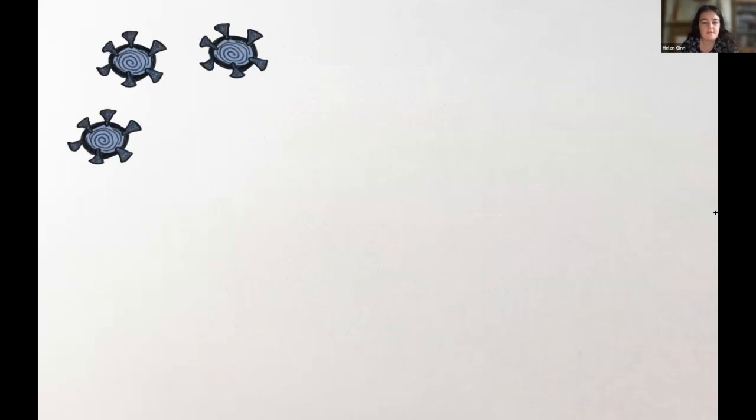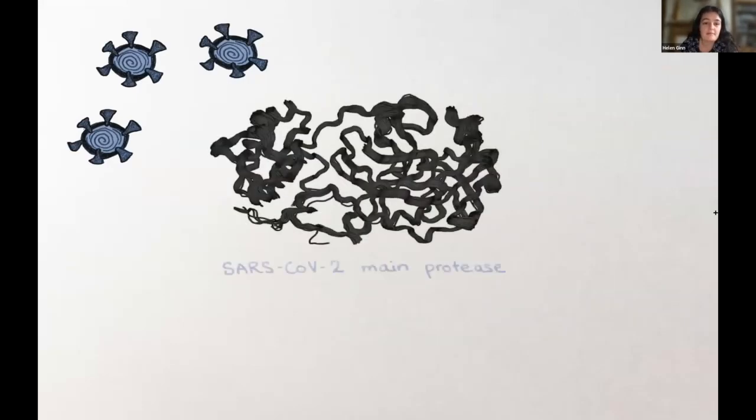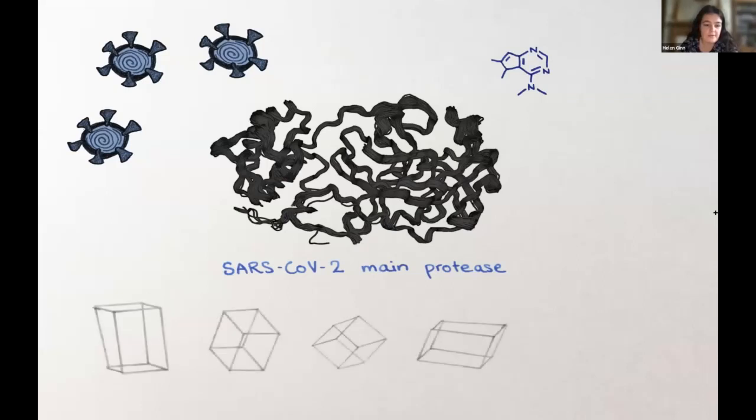So Cluster4X was developed in response to a number of drug screens or fragment screens that were performed at a number of beamlines at the beginning of the pandemic, mainly against the coronavirus main protease. And these drug or fragment screens were focused on collecting data from a number of crystals of the main protease and then passing it into excellent software, PanDDA, written by Nick.